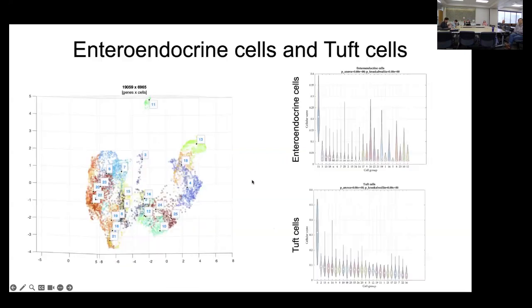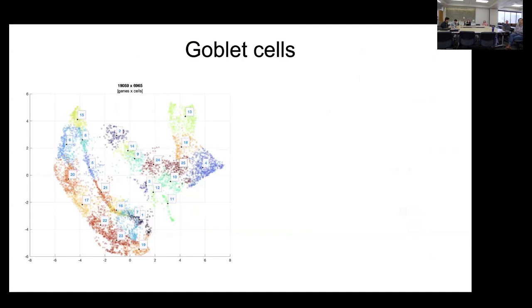That's actually pretty easy and shouldn't be too much. It's just because they actually pull away from the rest of the cells, because they are a differentiated cell type, but they are technically a specialized cell type as well. Expression is so different; they just separate from the rest.